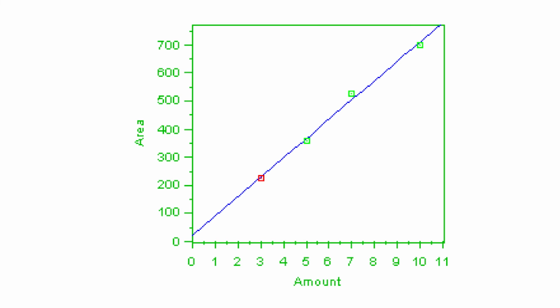Weighting the data. When fitting a curve to a set of data points, each point may be given a weight in addition to its x and y values. In the examples given above, all the data points have equal weight. If the weights are unequal, then the fitted curve will pass closer to the points that are more heavily weighted.